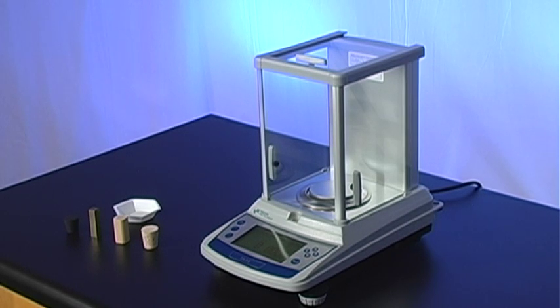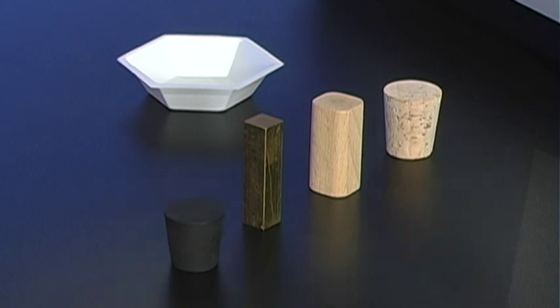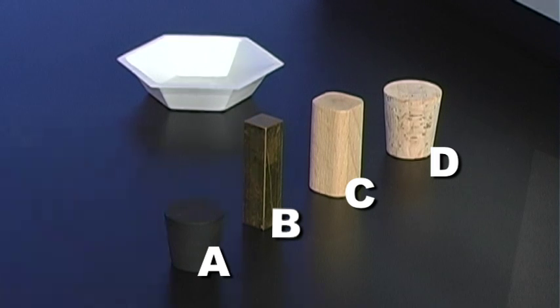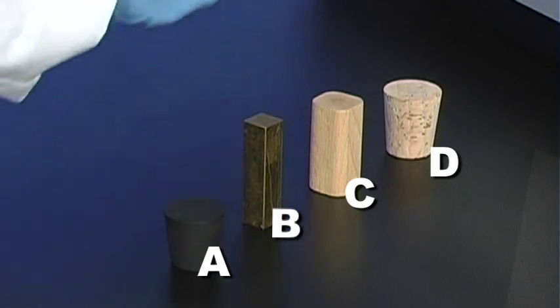Let's test our balance. We'll be weighing four items: a rubber stopper, a metal bar, a wood block, and a cork. Let's label them A, B, C, and D.